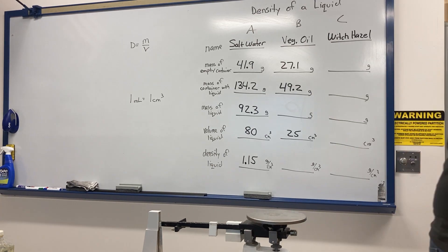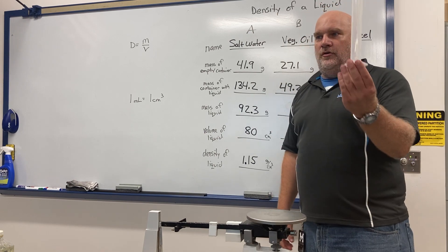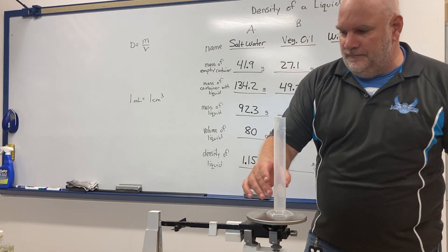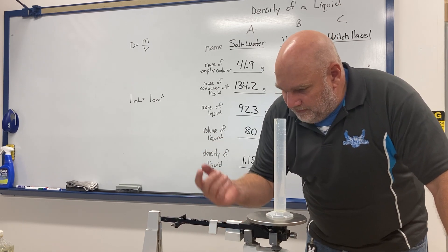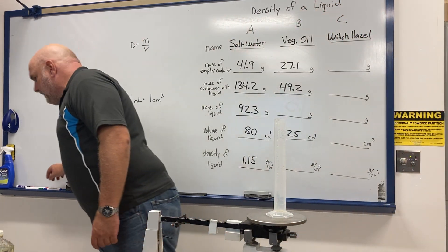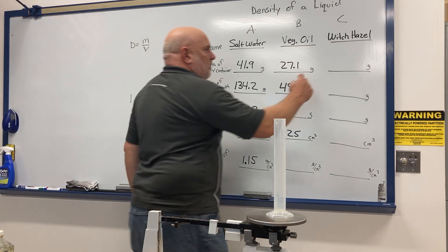I put the graduated cylinder on the balance to find the mass of the empty container — same graduated cylinder I used before — and I get 41.9 grams.